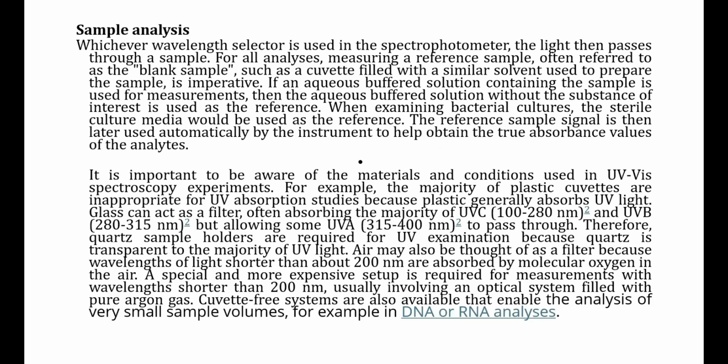Now, when you talk about sample analysis, it is used in a similar fashion to the colorimeter. You are going to have a blank, a reagent blank, water blank, or solvent blank, and the analyte. The analyte is kept in the sample holder. You change the lambda value, and you find where it is giving you the highest absorbance. The wavelength which gives the highest absorbance for a given analyte is referred to as lambda max. At that particular wavelength, you are going to do all the estimates or analysis of the sample where this particular molecule is present.